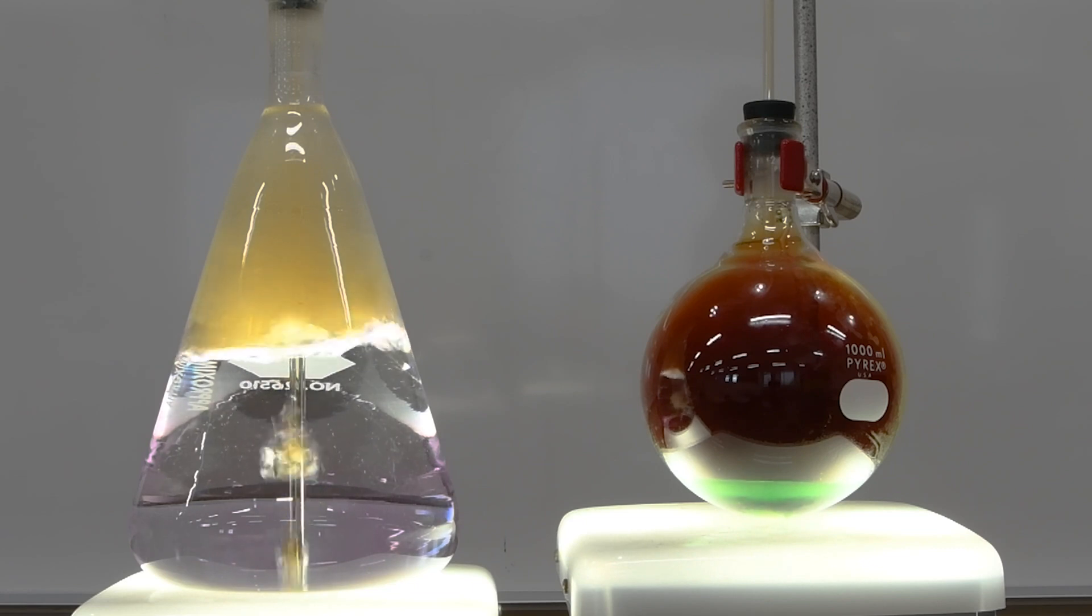It becomes clear. So the nitrogen dioxide forming in the round flask is bubbling over, dissolving in the water in the larger flask, and it's reforming a nitric acid solution.